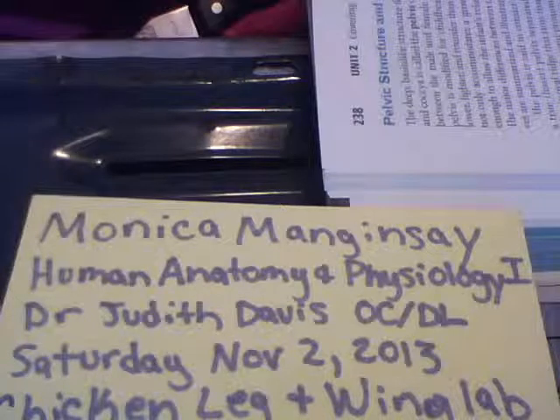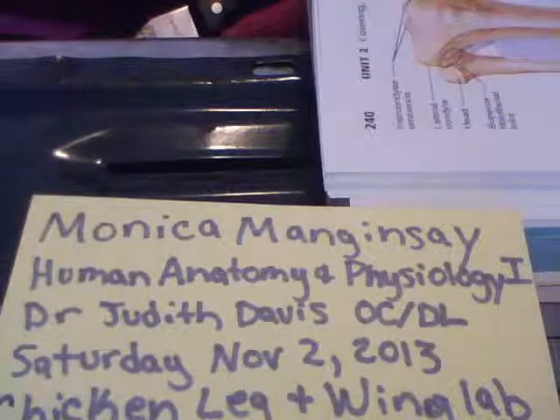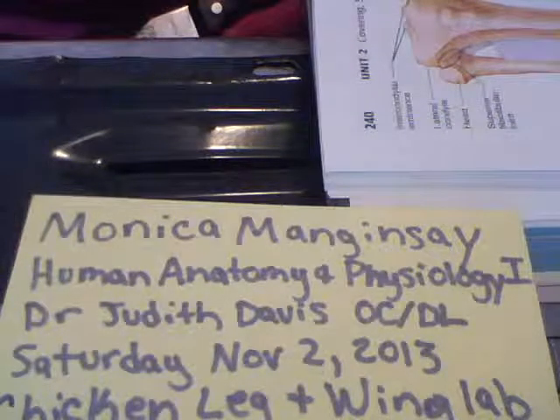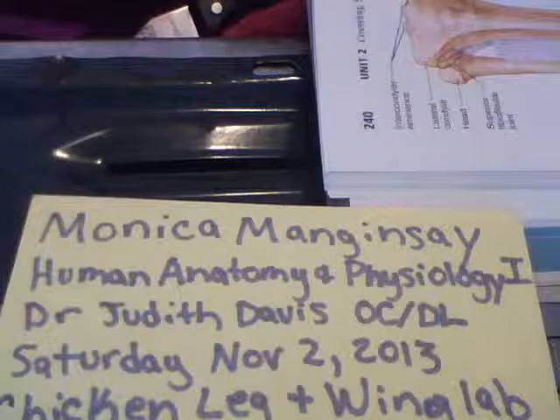At its broad proximal end are the concave medial and lateral condyles, which look like two huge checkers lying side by side. These are separated by an irregular projection, the intercondylar eminence.